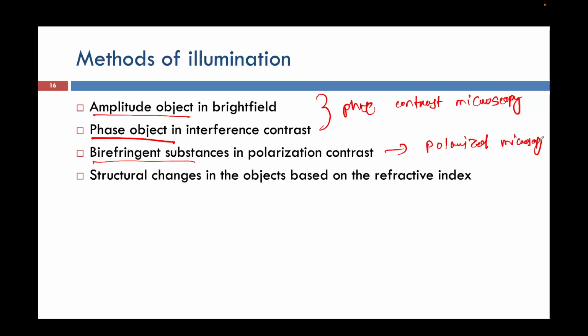Structural changes in the object based on the refractive index are also sometimes taken into consideration while we are illuminating the sample.